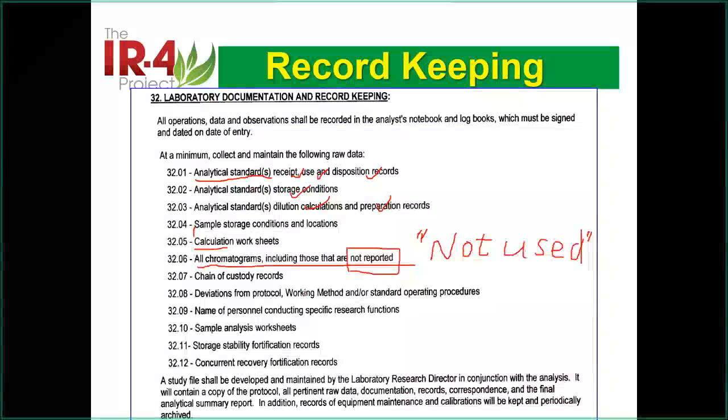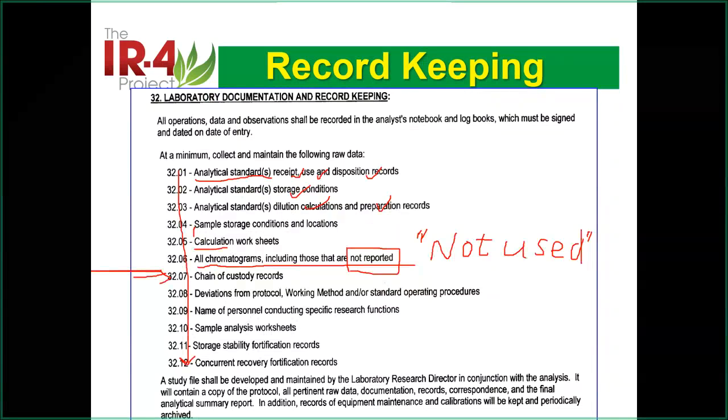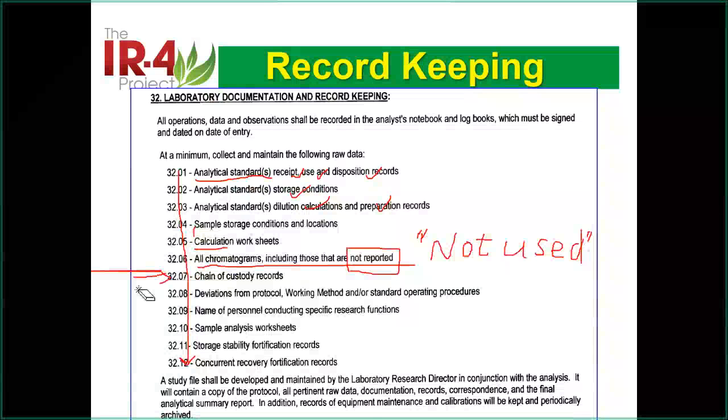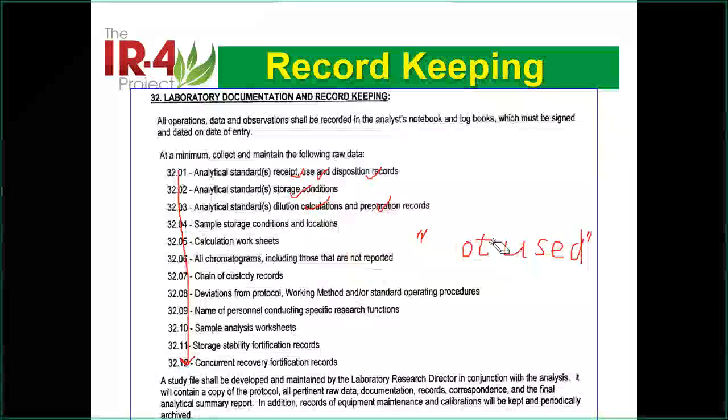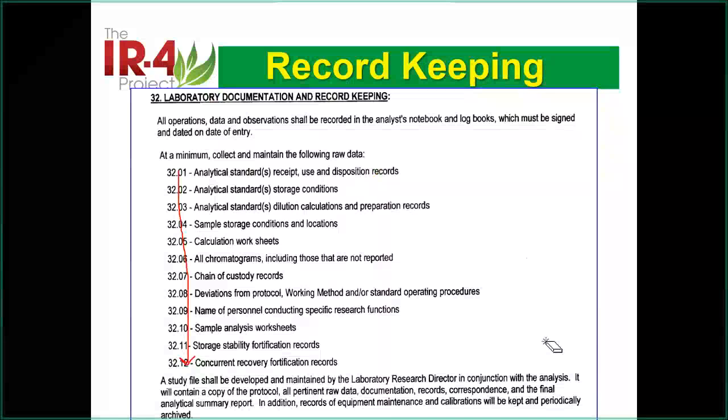Then chain of custody, this is quite important there. Deviations, all those things. Those are quite a lot there. I don't need to show you how much data. I know each lab is different, but that will be a big binder, a lot of data, like for a 5 trial study. Your data should be that big. That commonly happens because you do need so much work to prove you did that and did that correctly.